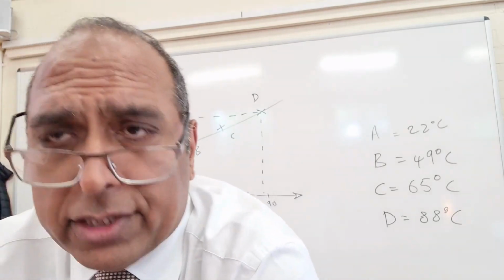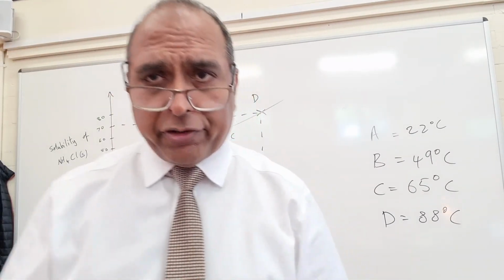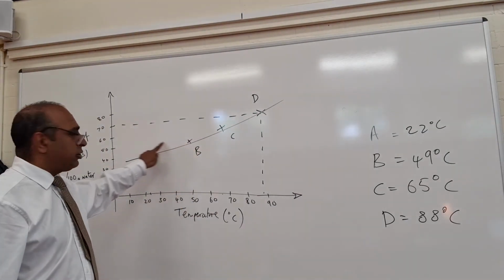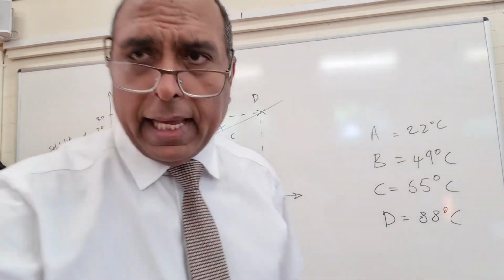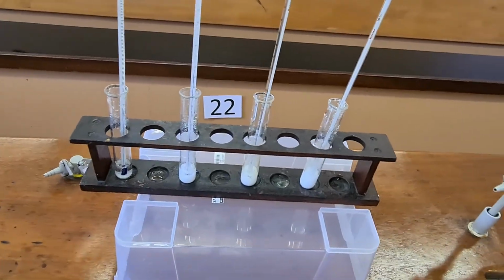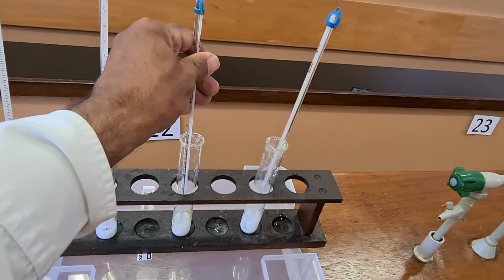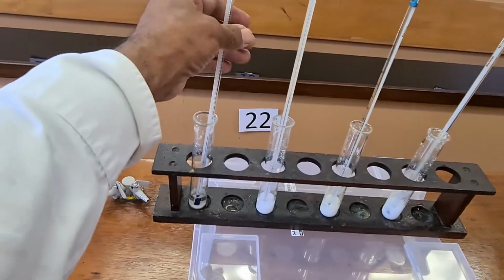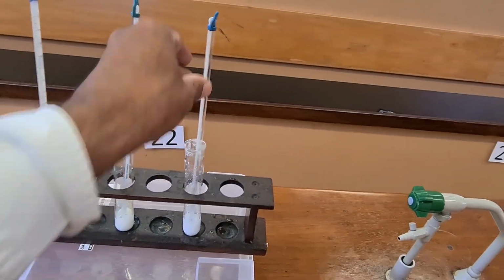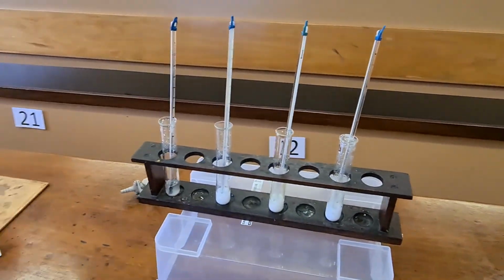And one of the ways is to work out how much crystals, in terms of grams of crystals you'll get, if you cool something down and it starts to form crystals, how much crystals you'll get. And calculate here, if we knew the temperature, we could calculate the quantity of crystals that each of these test tubes, 4 test tubes, will produce. Can you see? This one has got more, but then we put more in. We put 3.5 grams in.